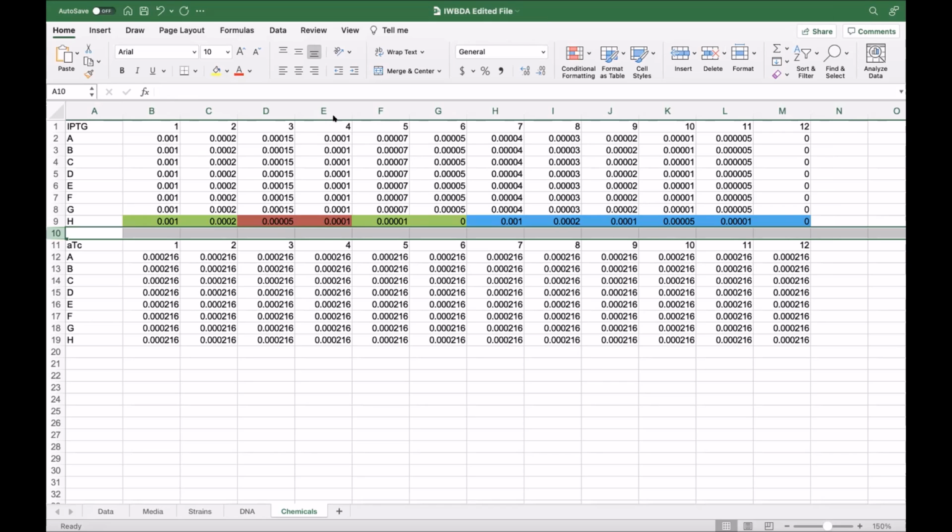Yeah, you can. I mean, if you want to extend the model, you need to create new relations, new database tables, models, and then go to the parts in the code where the data is uploaded. So you will get that data and store it into the database, and then modify, maybe adding another endpoint for getting the objects of that table, but it's pretty modular. I will show some of that stuff in the next part. I will go more into the code. Okay, thanks. Yeah, I'll let you get on with it then.